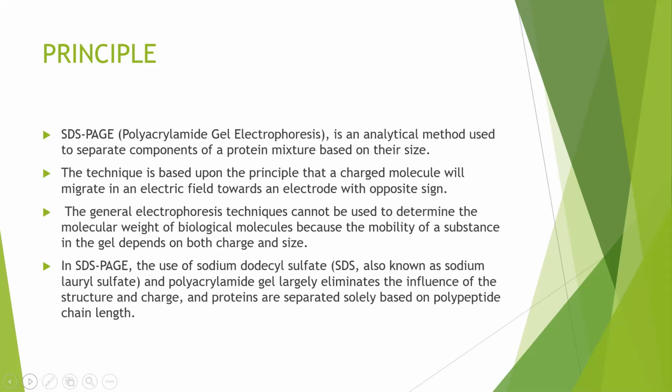Principle: SDS-PAGE is an analytical method used to separate components of a protein mixture based on their size. The technique is based upon the principle that a charged molecule will migrate in an electric field towards an electrode with opposite sign. The general electrophoresis technique cannot be used to determine the molecular weight of biological molecules because the mobility of a substance in the gel depends on both charge and size. In SDS-PAGE, the use of SDS and polyacrylamide gels largely eliminates the influence of structure and charge, and proteins are separated solely based on polypeptide chain length.